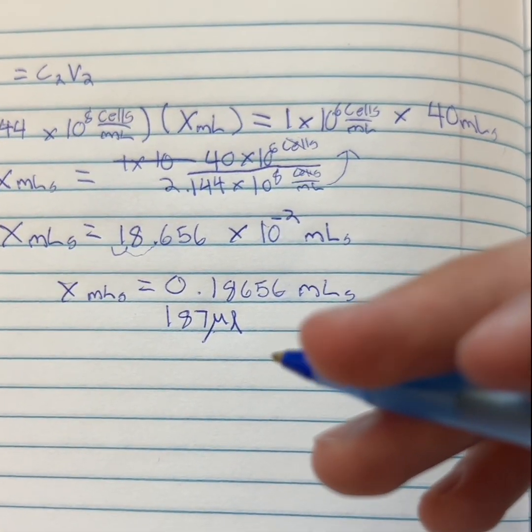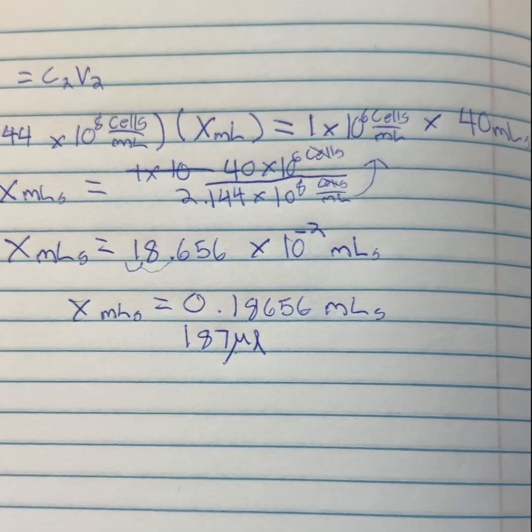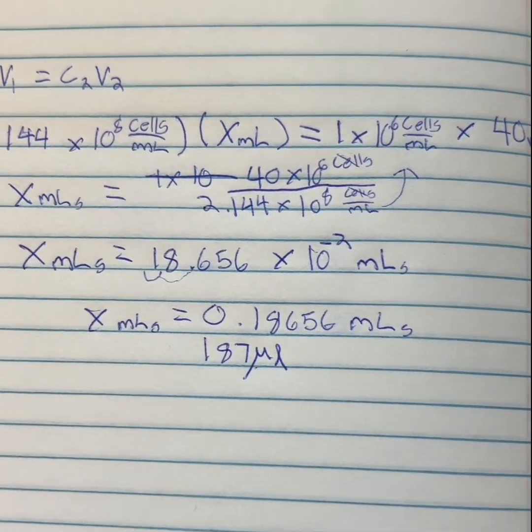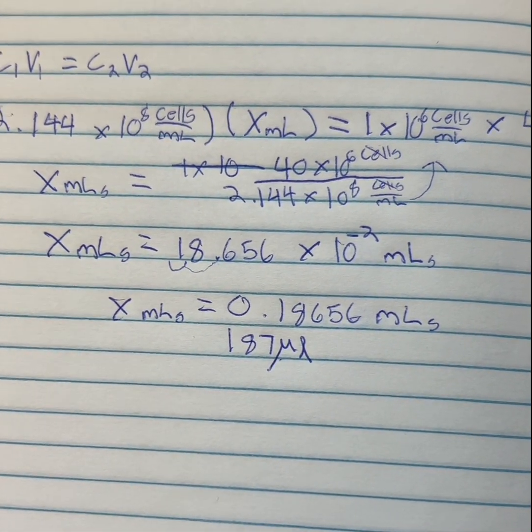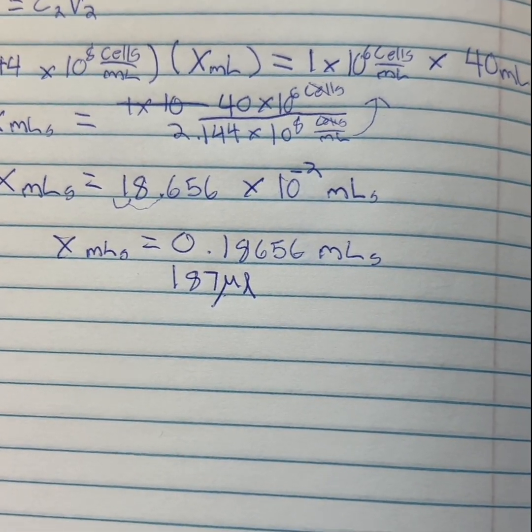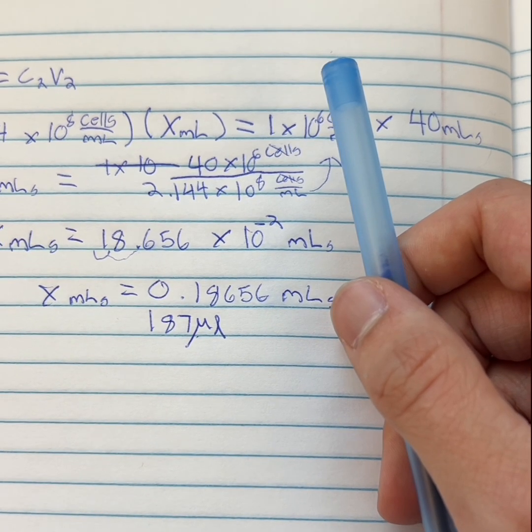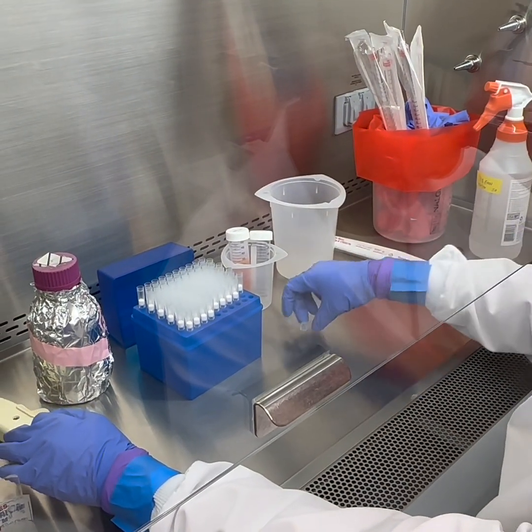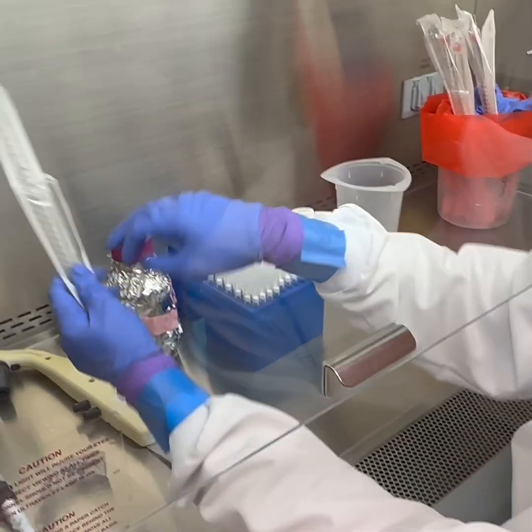This is important because we want our plates to be standardized across every single experiment so that we're working with the exact same cell densities, so that we can compare apples to apples and not apples to oranges. Hopefully the biofilms will form consistently across every plate in your experiments, and you'll be able to compare test mediums and see which compounds are more effective at dispersing biofilms.